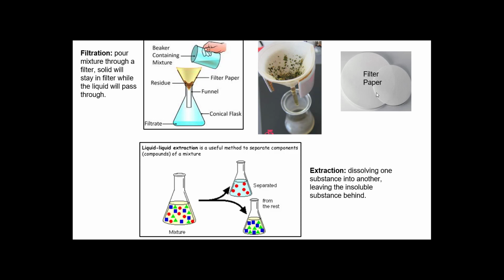They're meant to be wet. They're meant to filter, but they also are gentle enough that if you poke them enough, you can break them. They're not exactly paper. They're not exactly cloth. There's a mixture in there that kind of keeps them a little sturdy while they're in a filter. I've never once considered what they were made of, even though I've used them many, many times over the years. And then you would place it in a funnel and then allow the liquid to pass through. Depending on what you want, in some labs, you may want the solid and you would discard the bottom. And in other labs, you want the liquid and you would discard the solid.